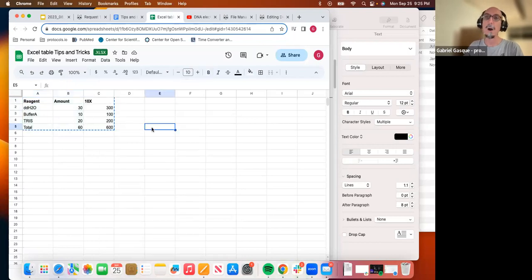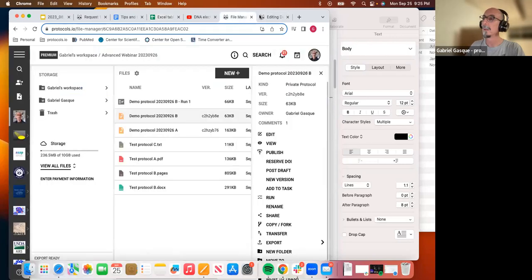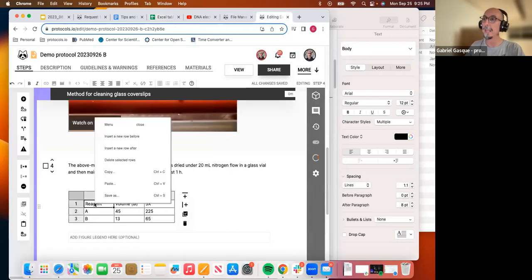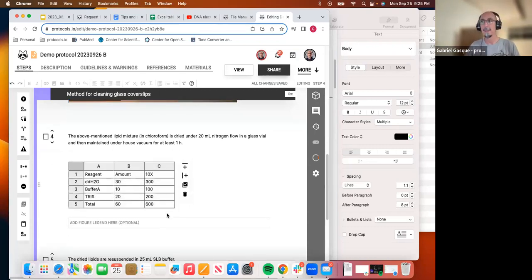the amount. Now, I want you to pay attention because in this case, this column is the original volume multiplied by 10. But it is the value, not the formula, that is being displayed. So I can copy the table, go to my table, and paste it here. And now the table has been copied. However, what has been copied to column C are the values, not the formulas.